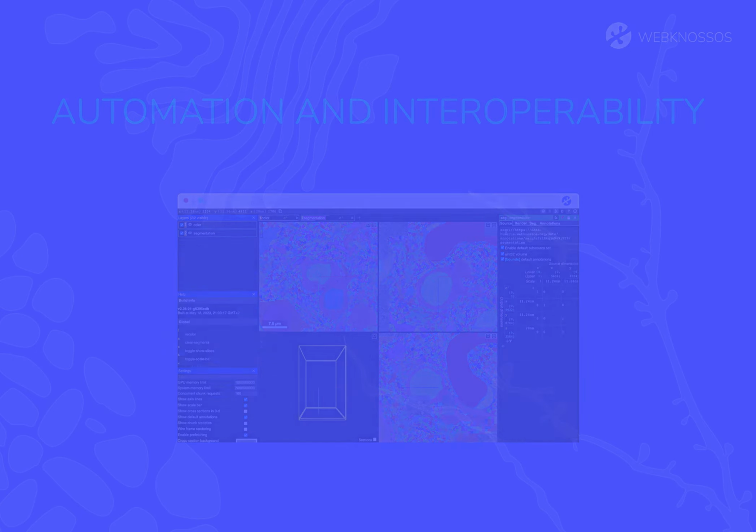Then, access the Download option from the drop-down menu and select TIFF Export. Choose the layer you want to export and click Export. The TIFF stack will be saved in your download folder.